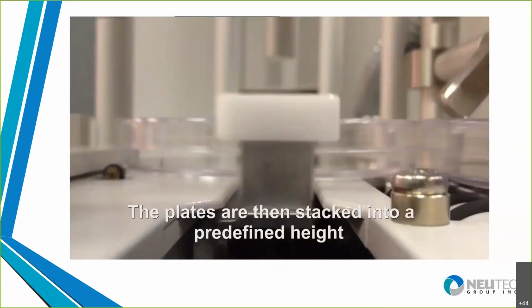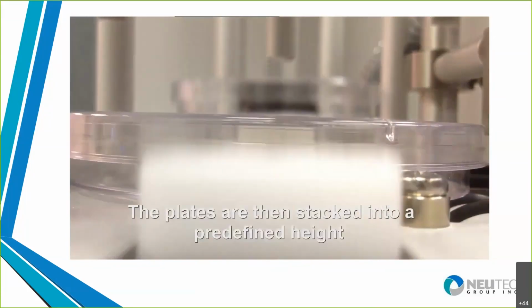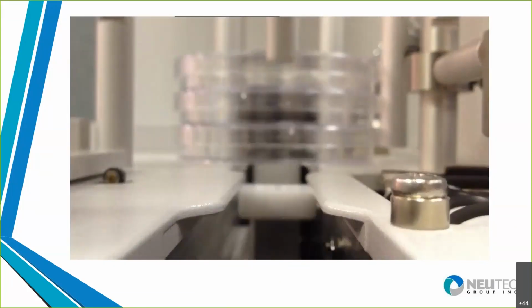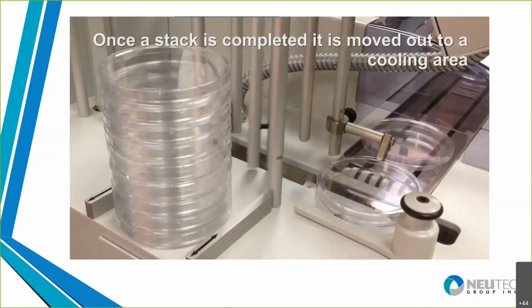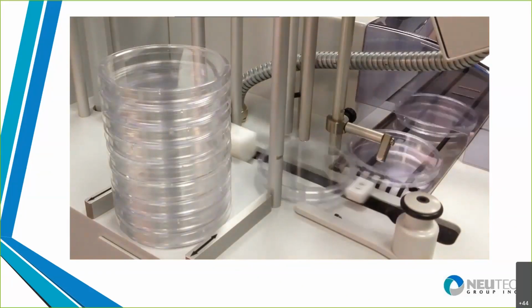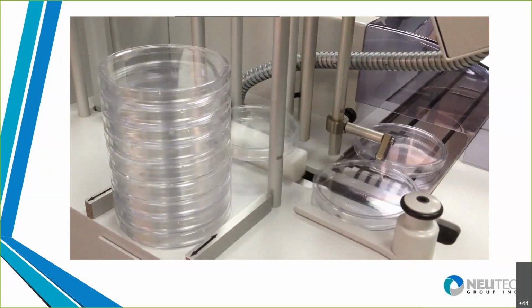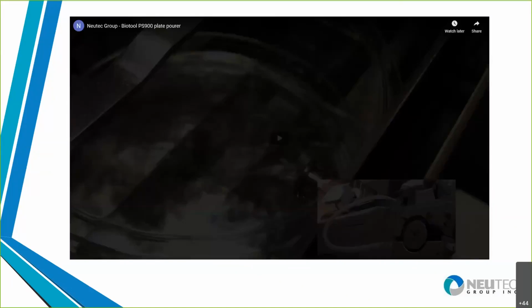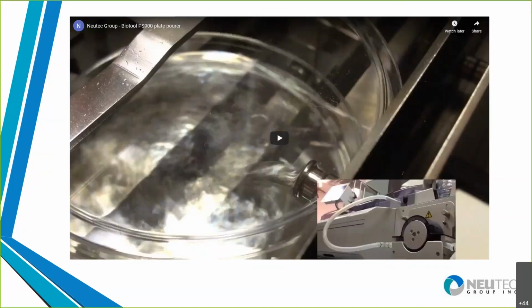Once the media is filled, the system then transports the plates and stacks them, again, in predefined heights. So you tell it how many high you want that stack to be, and then it automatically removes them and puts them into a line that will continue to grow based upon how many of the plates you're going to run in a certain batch. So in terms of use, this is a fairly simple process, very nice, very automated, fairly easy to set up and program and get up and running, but just has a huge efficiency for being able to produce media.